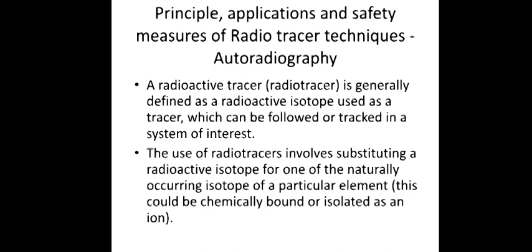So this is the basic principle that is used in a radiotracer technique. You have certain isotopes, certain elements, which over a period of time are going to decay by emitting certain radiations. This is important because if you could detect the radiation or the particle that is emitted, you know that these given isotopes are present in a given area. It might be a tissue or a sample.